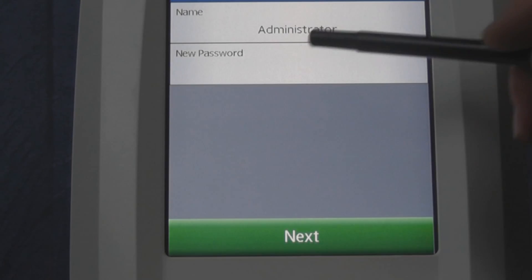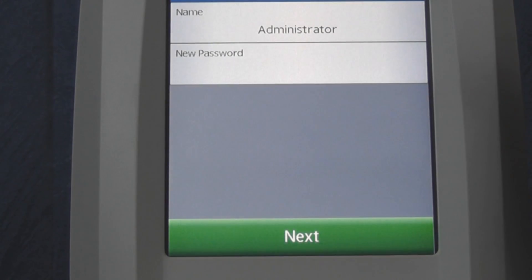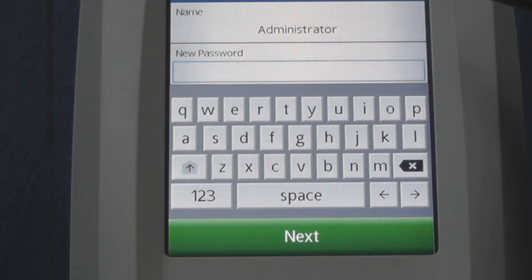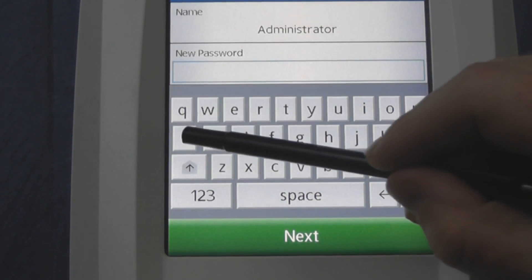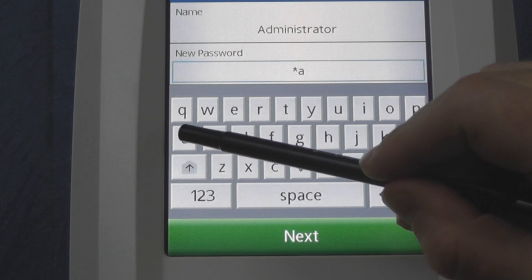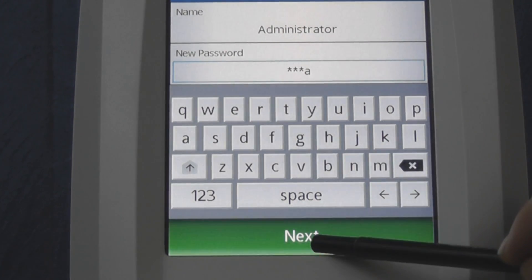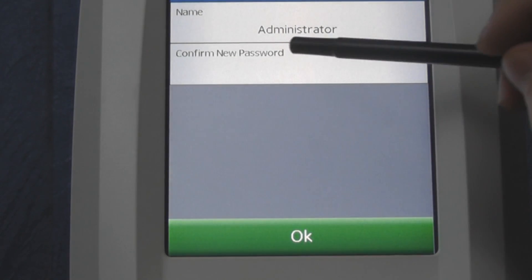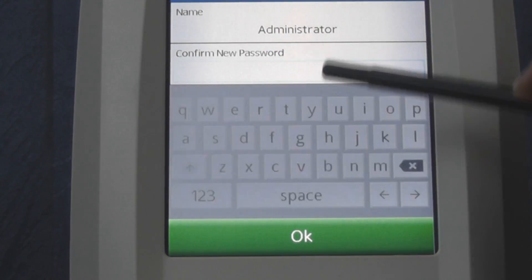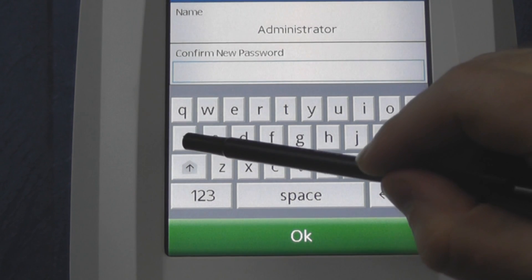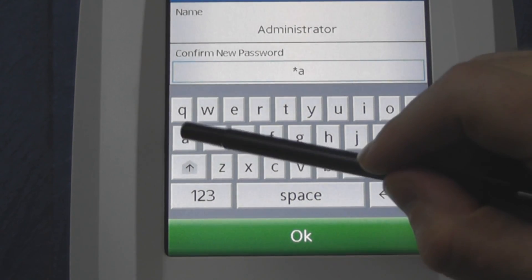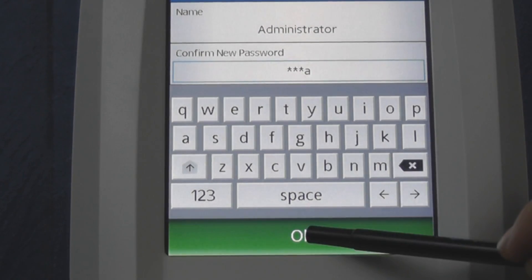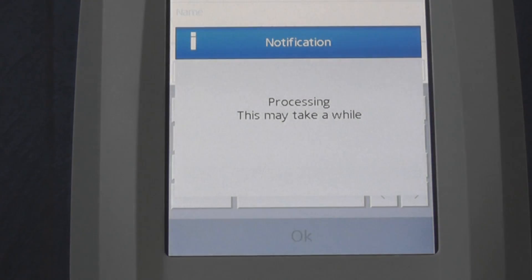It will then prompt you to choose another password that is different and unique. Once you have chosen a new password, press the Next button and it will ask you to confirm the new password. Once confirmed, press the OK button again and you will be logged in as the Administrator.